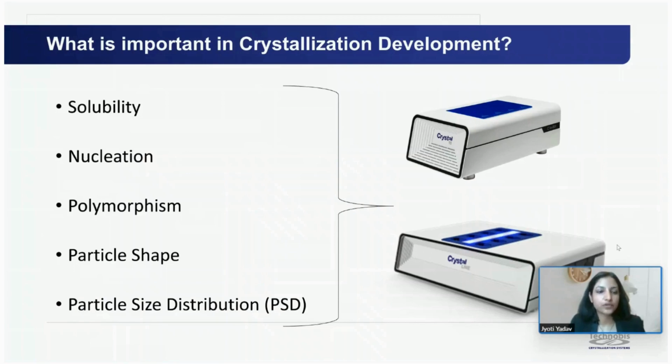We will go through each parameter and discuss why it is important to measure them and how we can measure them using these small-scale single platforms.